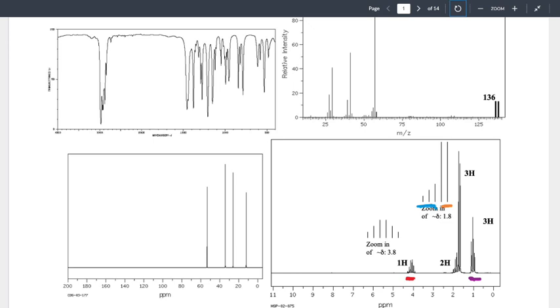So what's the next interpretation? CH3. What's the next interpretation? Okay. That right there, particularly in combination with your formula, is enough to figure out the answer. That sets you up that there's only one option that you can possibly manage to get you your correct answer. That's it. Okay? So you could solve it, and I'm okay with that.